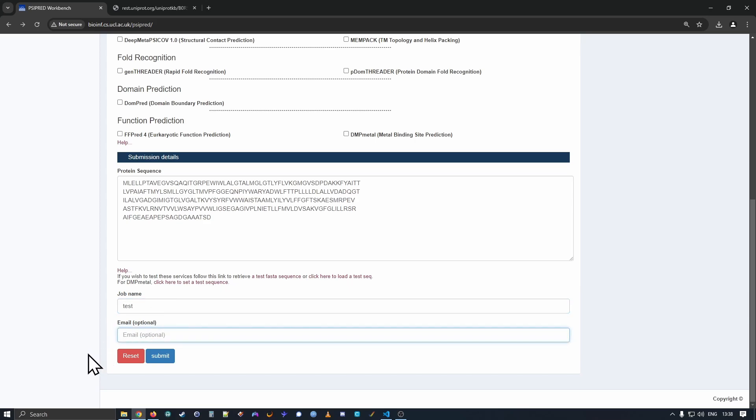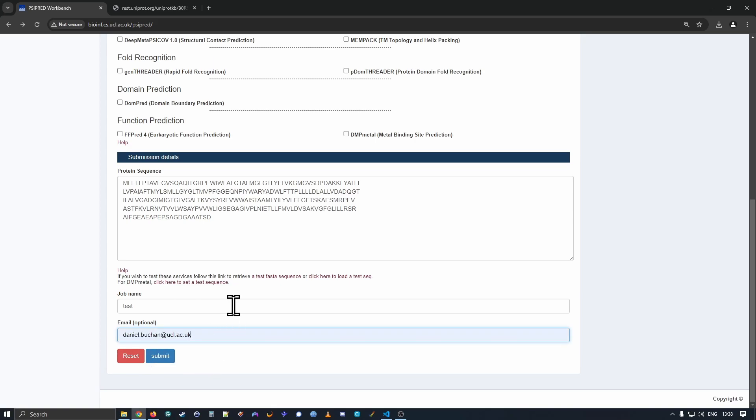Lastly, we ask that you provide an email. This is optional, but we suggest that it is a good idea because then when a job is finished and the analysis is complete, we'll send you a reminder email with the link to get your results. Otherwise, you have to leave the webpage open.